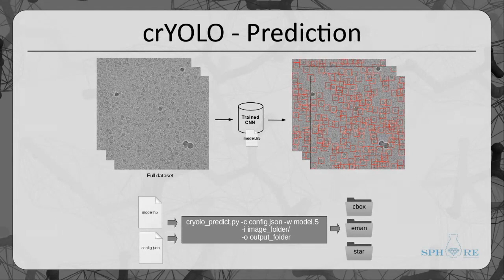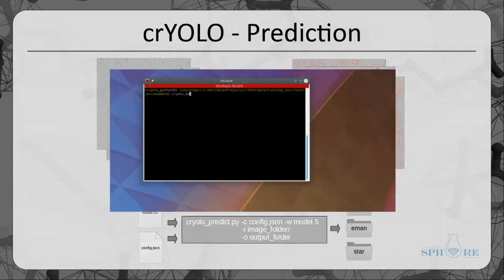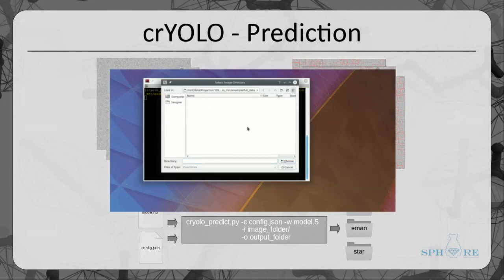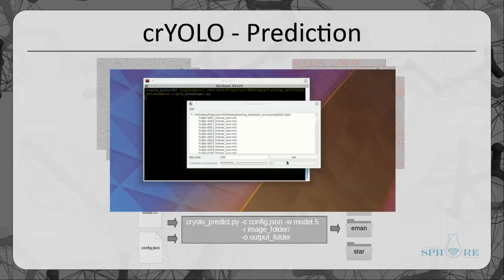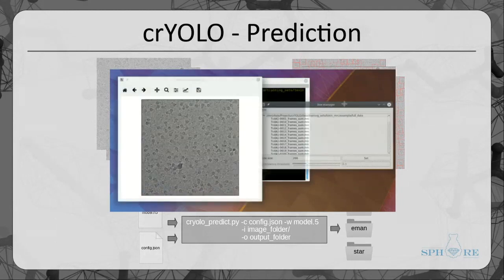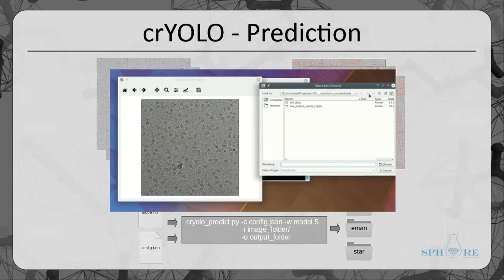And so during particle picking, each particle gets a confidence value assigned. And in the EM box files, the default is 0.3. But it might be that this is not the optimal confidence threshold for you. In this case, the CBox files become handy.